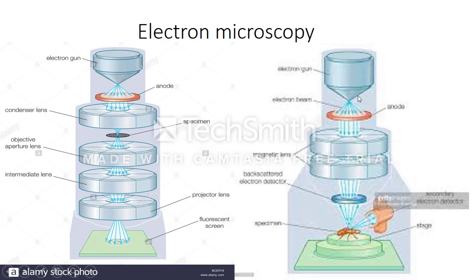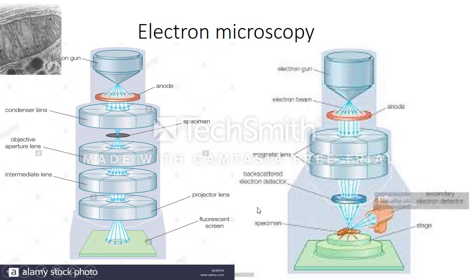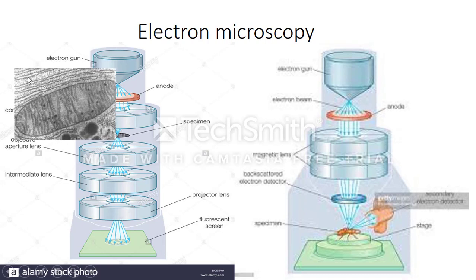And in this case over here with SEM electron microscopy, the specimen is here. The electrons are shot towards the specimen and detected over here. And as shown, they bounce off in this case, and they go straight through in this case. And this ends up giving two different kinds of pictures. With TEM microscopy, you end up with pictures like this, which are really good with optimized resolution, and the images are high in detail. However, we do have to kill the cells to see them like this.